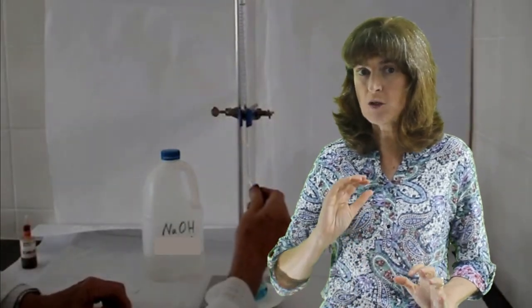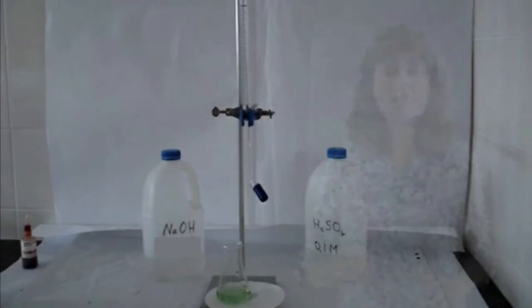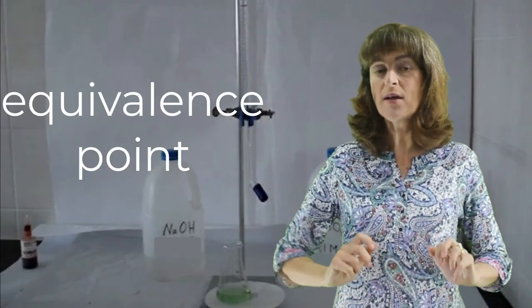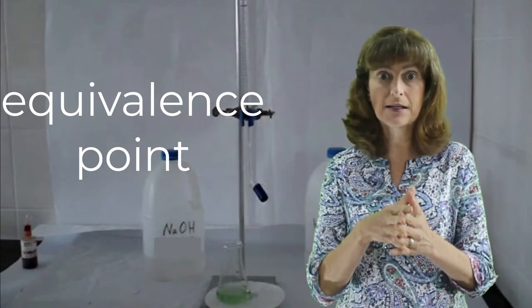But now we can see that we're getting close to the equivalence point, so we need to operate the tap more carefully. If you're very good at a titration, you manage to end the titration at the moment when one drop, or maybe even just half a drop, turns the color of the indicator. If you've chosen an appropriate indicator for the particular acid and base that you're titrating, the point at which the color changes is the equivalence point, the point when stoichiometrically equivalent amounts of the acid and base have reacted.